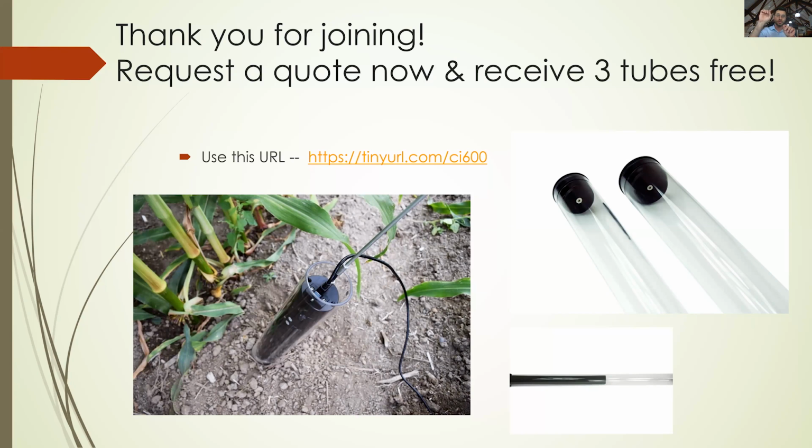But it does do some automation in the software itself. So when you do, say, a few lines, you're going to automate, and it will try to estimate by the pixels how long those roots really grow. I find that very useful. Towards the ends, it gets a little wonky, but you just snap them back into place real fast, and that makes the process a lot faster.